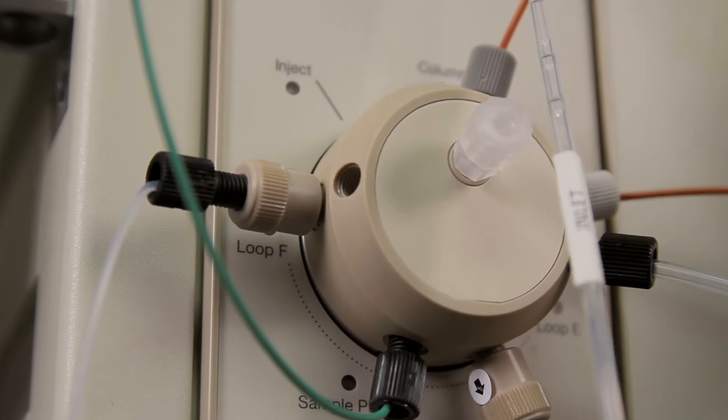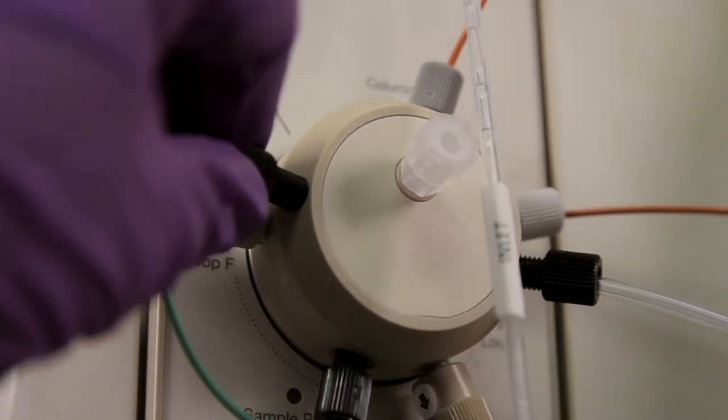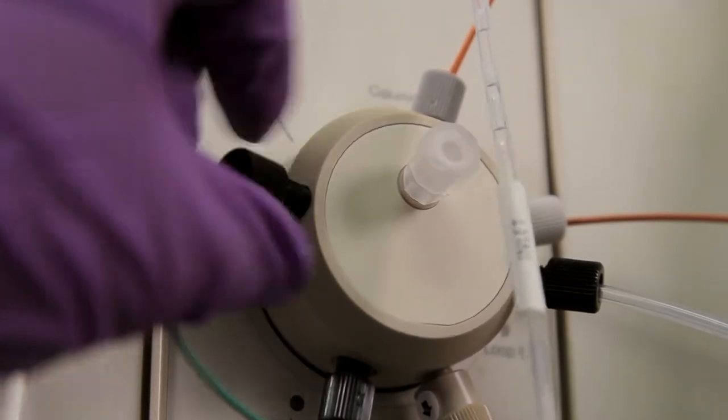Once all air has been eliminated, connect the 0 mil end of the Dyna Loop to Loop F of the injector.